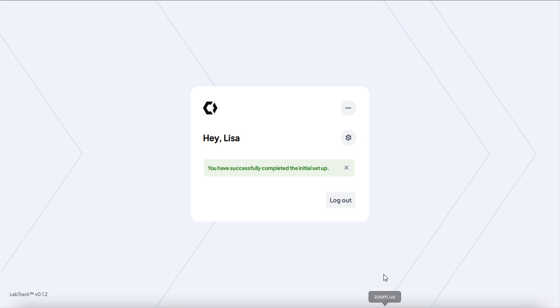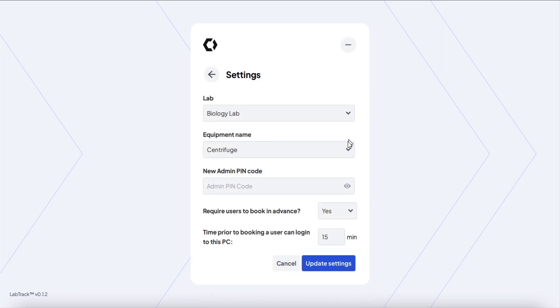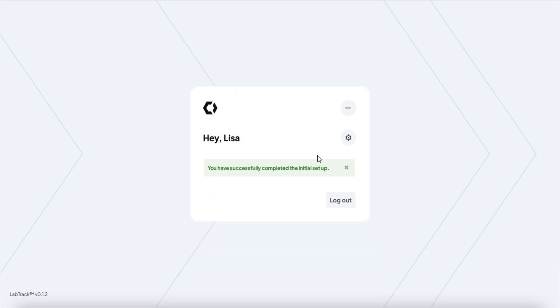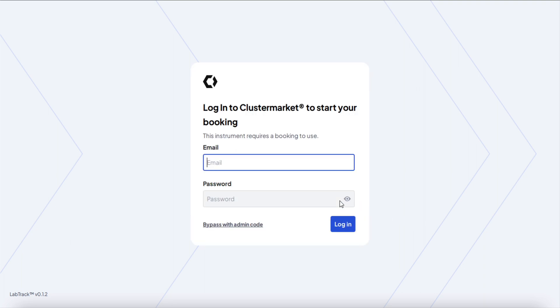You're all set. This completes the initial setup. You can click on the settings wheel to change any of the things we just went through, but that's pretty much it. After this, you should log out, and then the screen is ready for whoever wants to use the PC and the instrument. Clustermarket starts tracking the sessions from this point onwards.